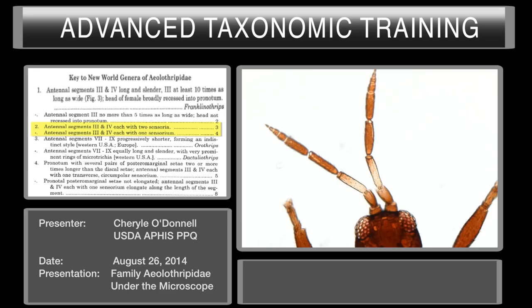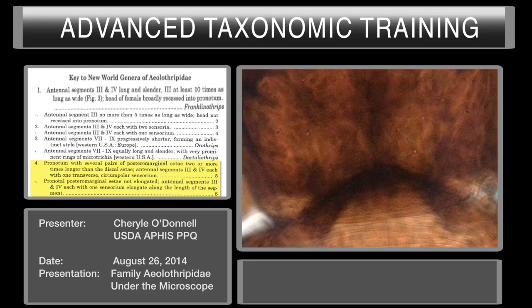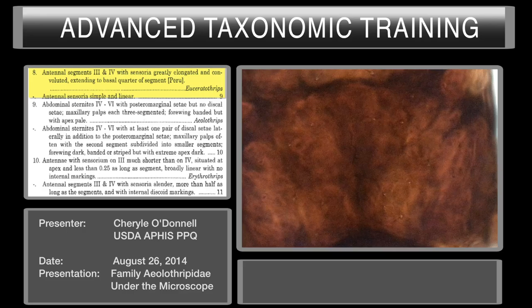You can also see the linear sensoria here on segments three and four. Following this couplet takes us to couplet number two, where we have a choice of whether segments three and four have only one sensoria or two. This one has one, which takes us to couplet number four. Couplet number four asks for the pronotum with several pairs of post-marginal setae, two or more longer than the discal setae. This specimen has very short setae on the pronotum — you can see them right here, very short. There are no long setae along the posterior and no setae on the anterior of the pronotum.